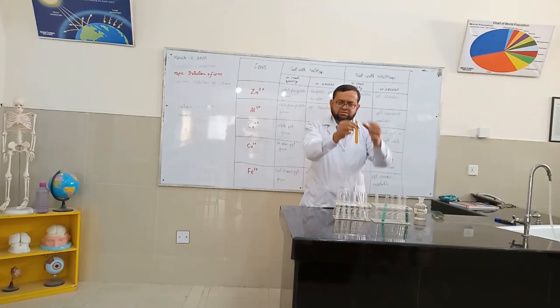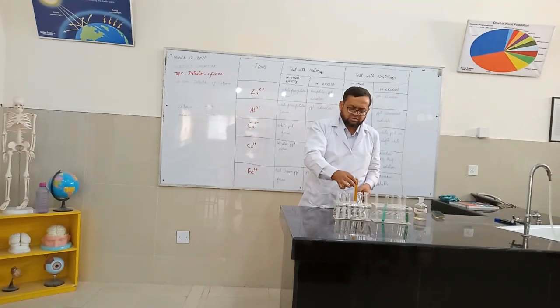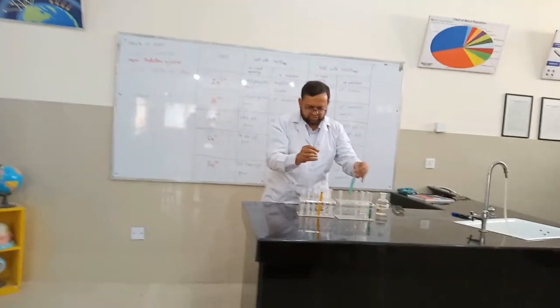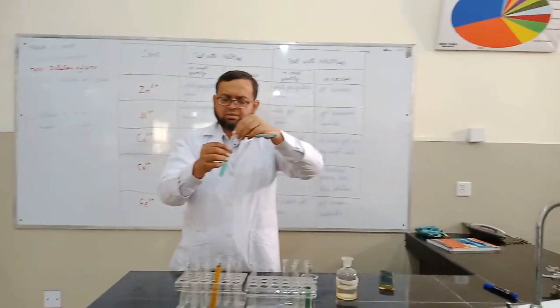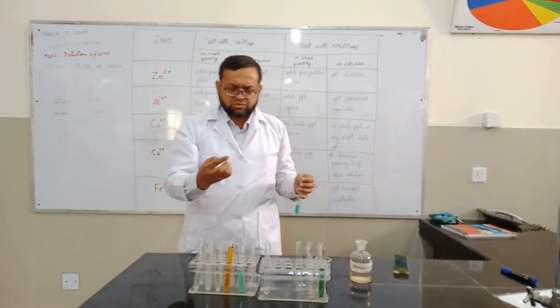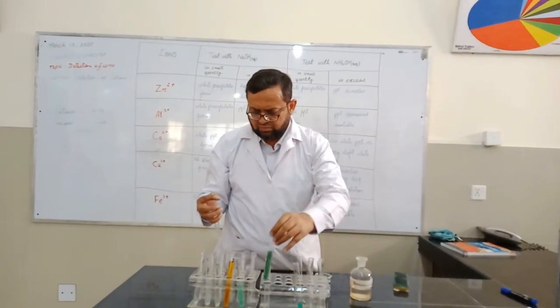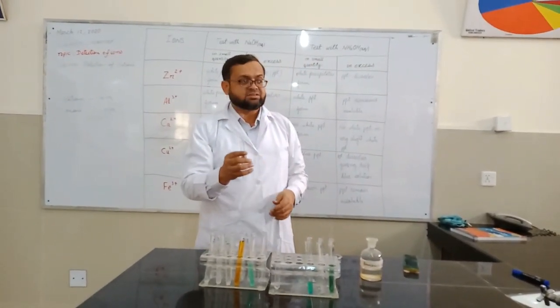Sample D is colored. This compound is brown, a slightly light brown color. And we have solution E, which is blue in color, and here solution F. I will repeat solution F because it is unstable.